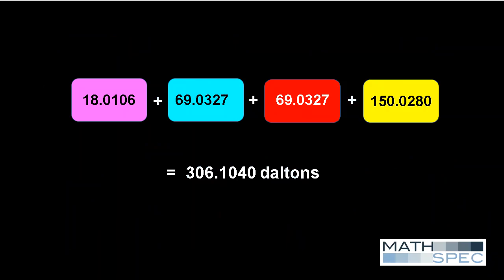Our partition software adds together combinations of subfragment masses to find groups of masses that sum up to the molecular mass of the precursor ion. These are mathematical partitions of the molecular mass. In a typical data set, there are usually over 1 million partitions of 3, 4, or 5 masses. We then calculate the masses of every subset of the masses in each partition. The best subsets will sum up to the masses of the most intense fragment ions.